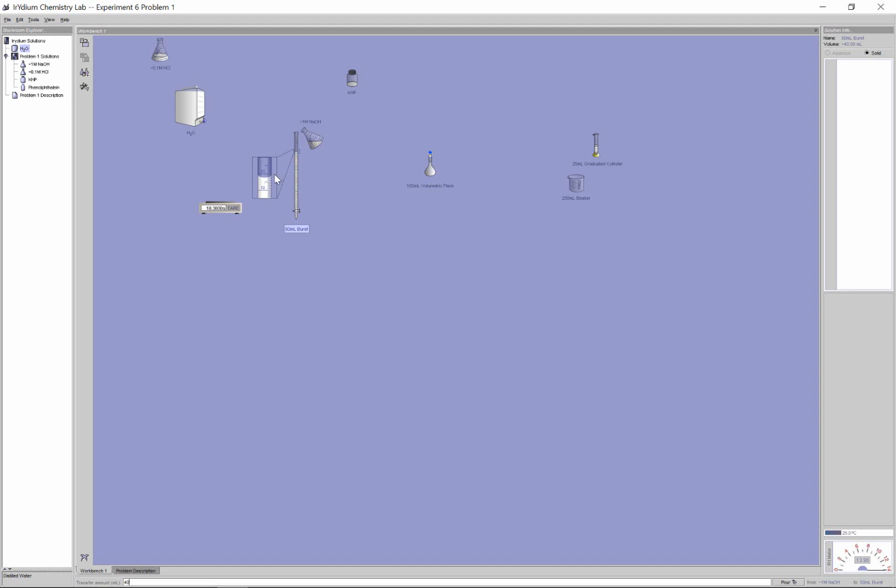I don't know if you're going to be able to see this here. This is currently between the 11 and 12 mark. They sort of zoomed in for us here. Remember, the numbers are upside down. That's why the 11 mark is up top. Always remember to take down the initial volume reading.